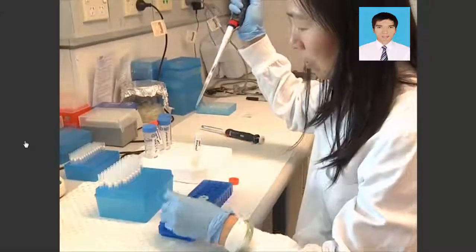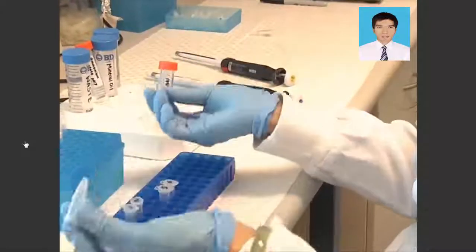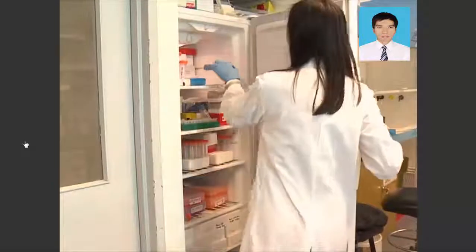Next, ethanol precipitate the DNA. Add ice cold 100% ethanol, 330 µL, and mix well by inversion. Leave at minus 20 degrees Celsius for 1 hour to overnight.